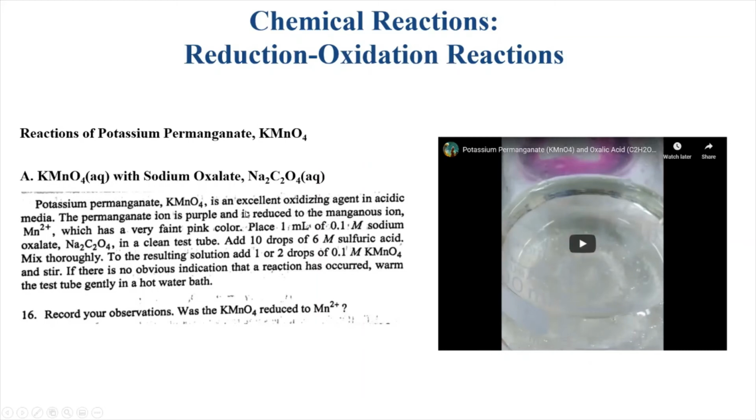this reaction. It tends to lead to something that's either transparent or has a very, very slight hint of some kind of pink or brown or yellow or even orange color to it. And it kind of depends on the day and what the conditions are. So now let's take a look at what we're going to do.